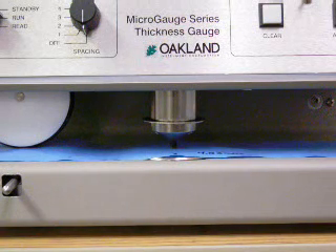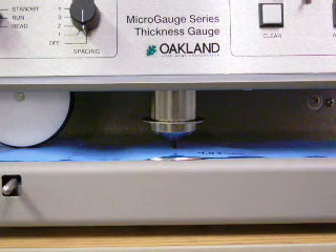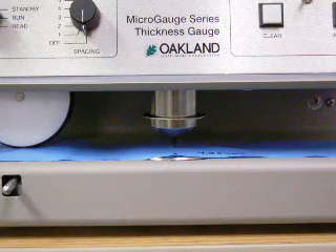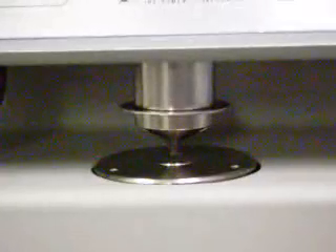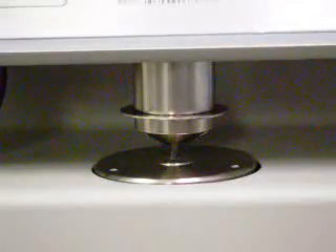Different contact foot configurations, pressures, and weights are available to match the specific requirements of the materials you are trying to measure. Low foot pressures are utilized if there is a possibility of material compression during the measurement process. All three micro gauge models also come standard with parallelism adjustment mechanisms to achieve parallelism better than 40 micro inches to ensure measurement accuracy is maintained.